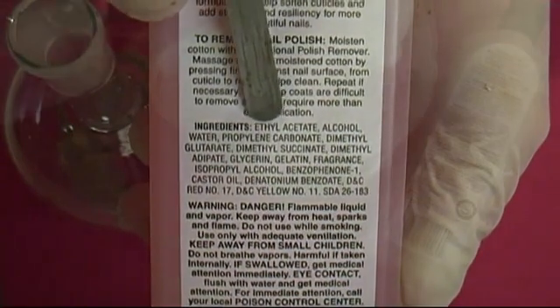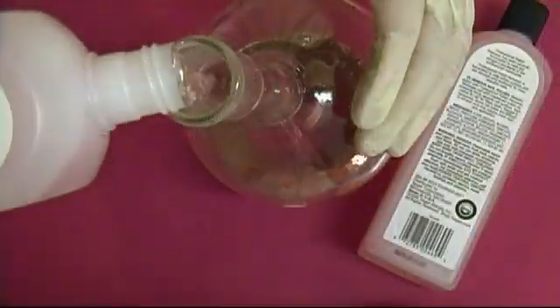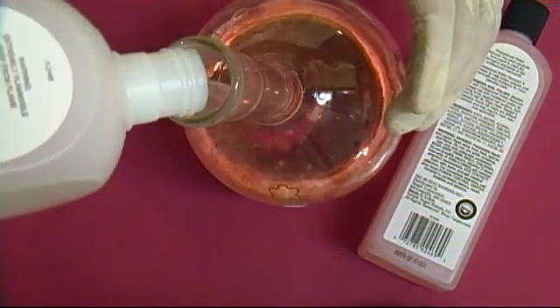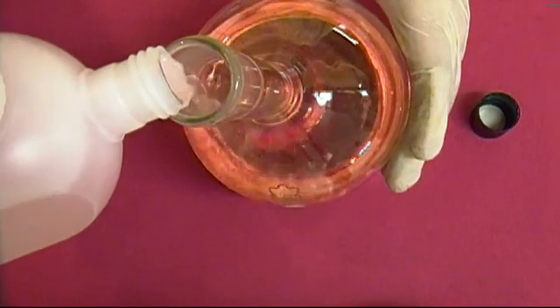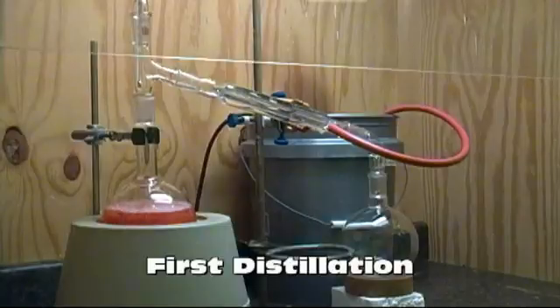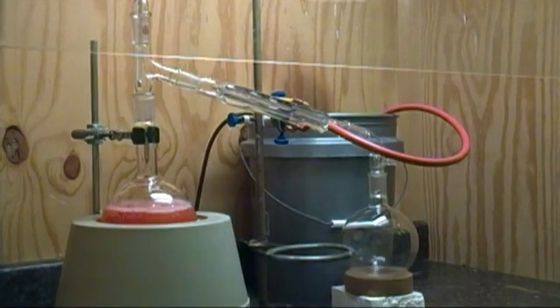Open both bottles and begin adding them to a 1 liter round bottom flask. We will start by doing a simple distillation. The ethyl acetate will come over at about 77 to 100 degrees C. For the brand that I used, it was first to come over. However, other brands may put in some lower boiling ingredients, so discard anything that comes over below 77 and above 100 degrees C.